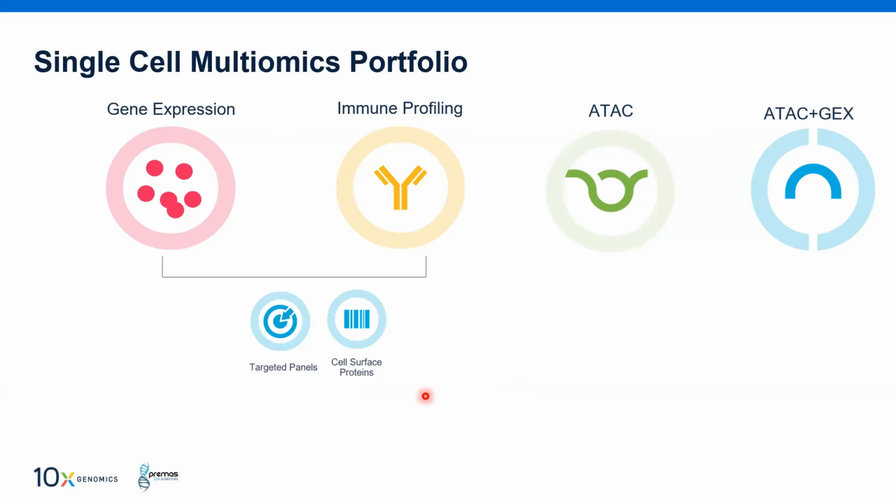Now, cell surface protein means you can generate data on protein markers or cell surface markers, similar to what people are generating using flow data. So flow data and transcriptome data from the same sample can be generated in one workflow. Then people in the area of CRISPR profiling are doing perturbations, and because of those CRISPR guide RNAs, what gene expression changes are happening. We are able to link both data in a single shot. So CRISPR screening is more streamlined and more productive, I can say.